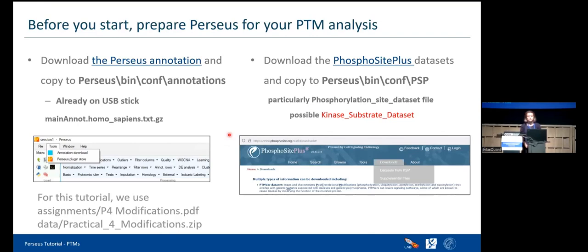In order to analyze your PTM studies on Perseus, we need to have two additional pieces of information. First, you need annotation files, which you can download from the Perseus tools and annotation download page. The people here already have them on USB sticks. But specifically for phosphorylation, you need to have the PhosphoSitePlus datasets.